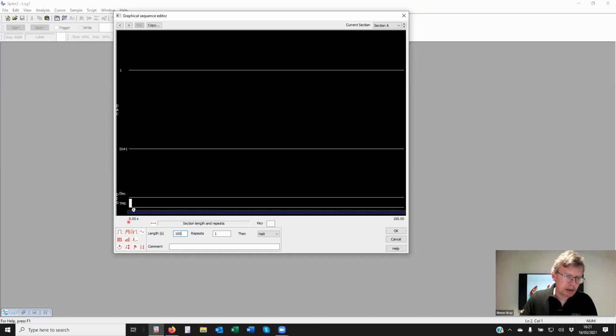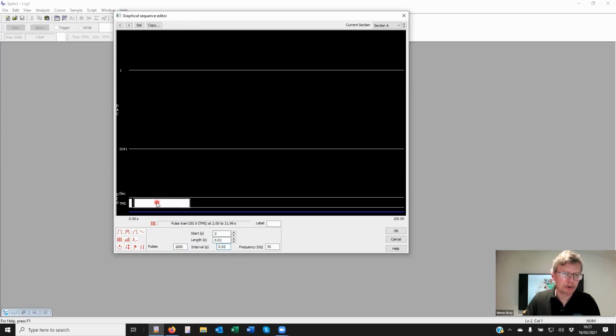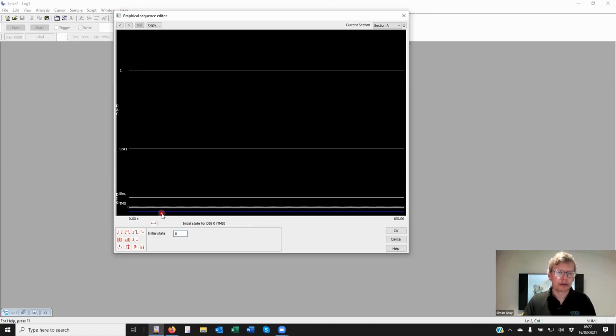Now I'm going to try very hard to put another set at the end, and we're going to say there are 1,000 of those, and the length 0.01, interval, etc., and joining them up. Okay. It's a mess. It's rather difficult to see. There is a limit to the number of pulses that can be output in one set. And as you can see, I can't see where these join up. So far better to throw away all of that and reduce the section length to something like 0.01.